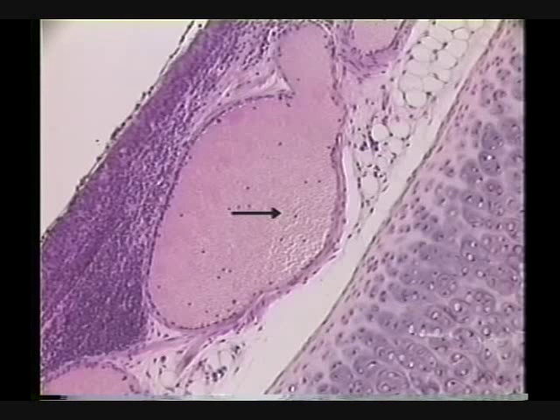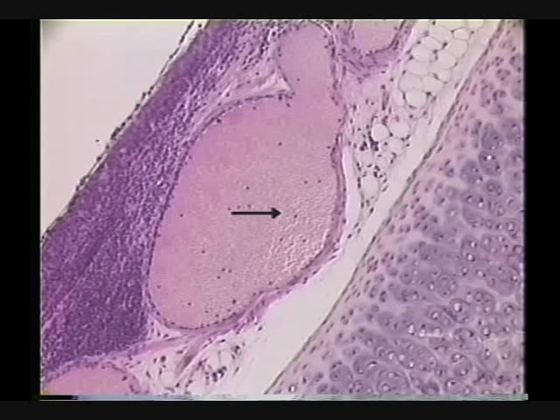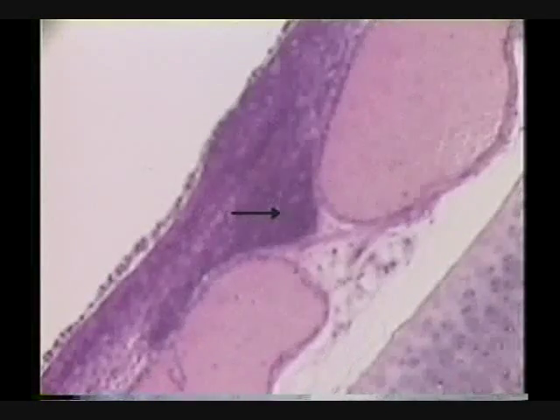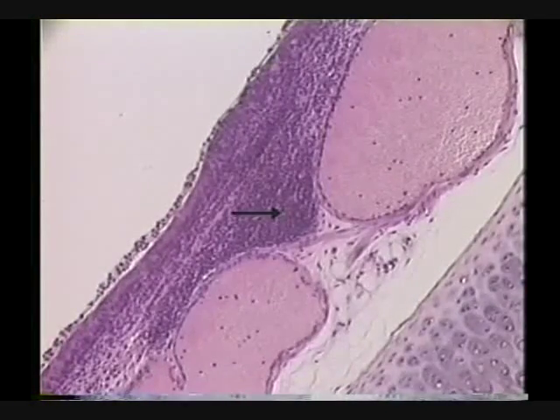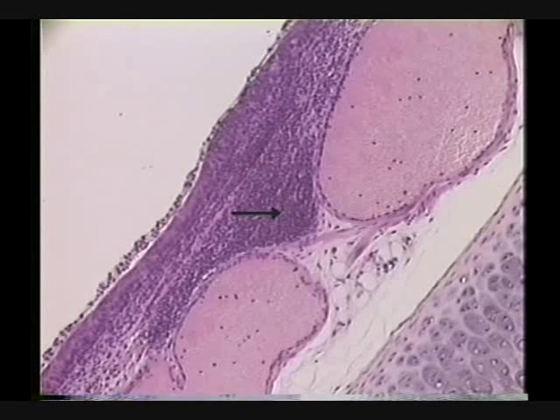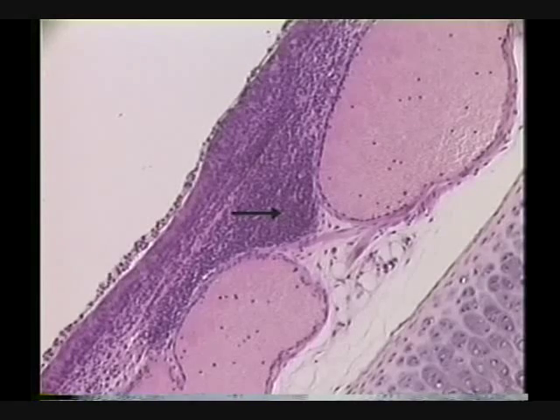Identify the structure occupied by the arrow. It is a vein. Identify the tissue occupied by the arrow. It is blood. Identify the dark material tissue indicated by the pointer. Lymphoid tissue. Yes. Lymphoid nodule right there.